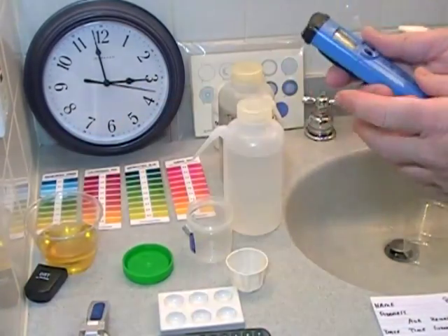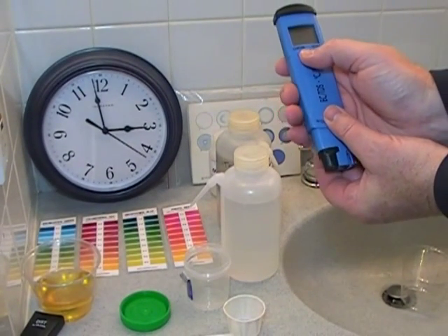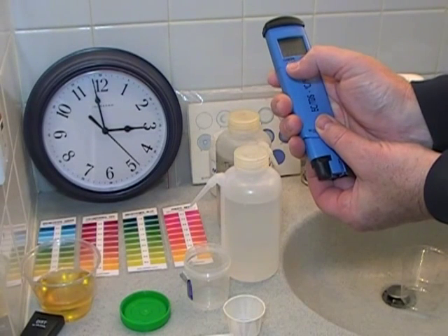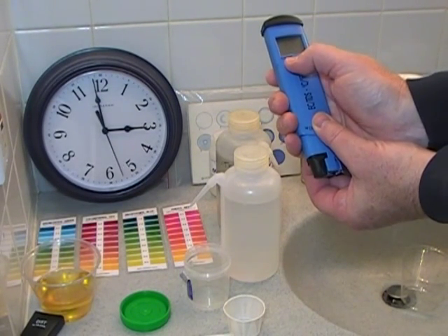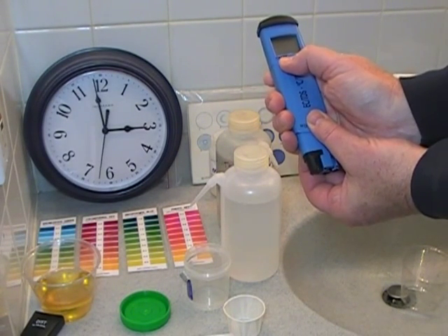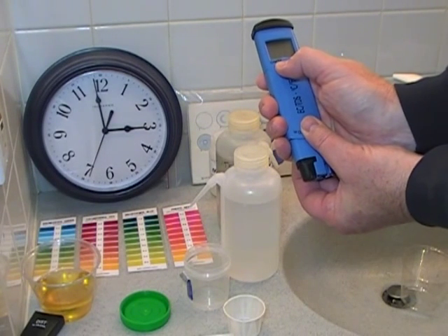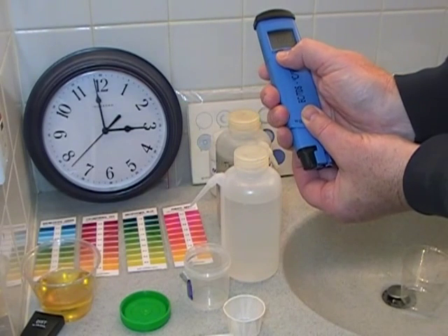Calibrate the conductivity meter. Calibrate. Calibrate. Calibrate. Calibrate.